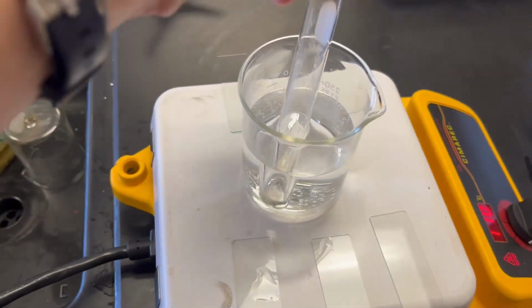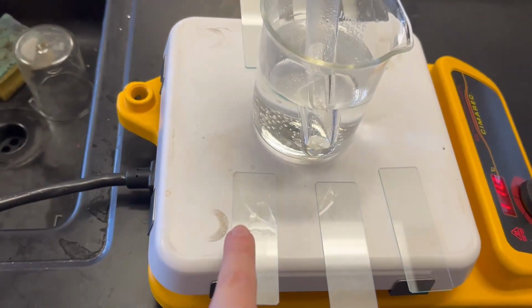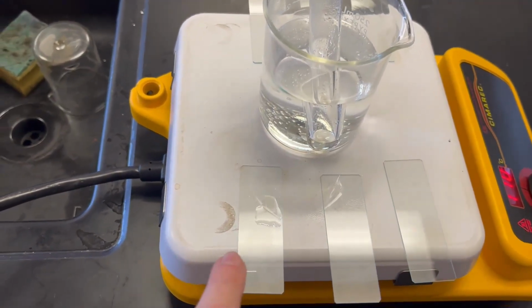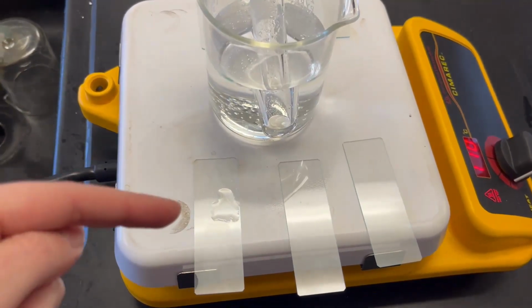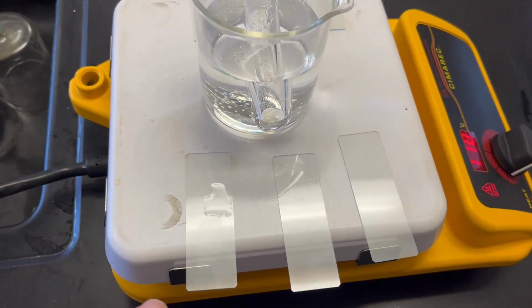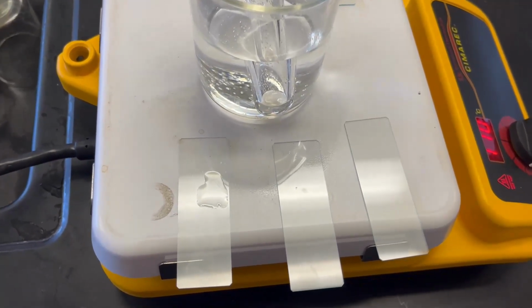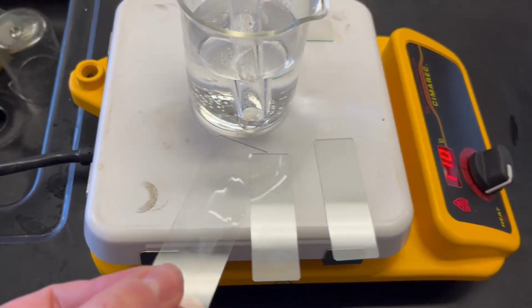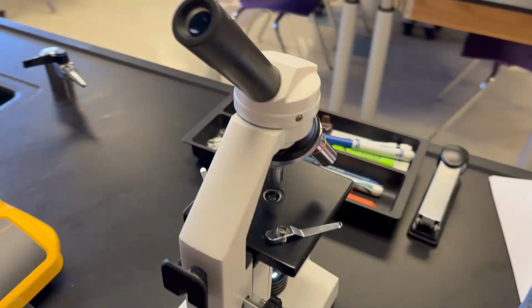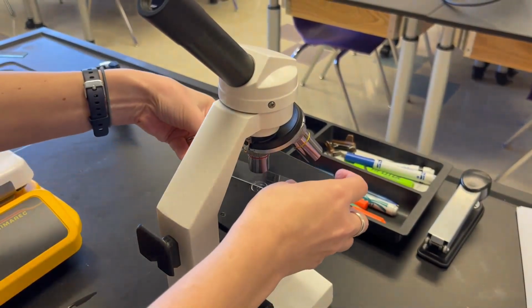Once you have your salol in a liquid form, then you can give students a drop on the warm microscope slides. And here's a great tip. These can be reused class after class. So after they've been crystallized, just take it back from students, pop it back on the hot plate, and it'll remelt. So you really don't need very much of the chemical at all. You're going to hand this to students, and they're going to put it under their microscope.